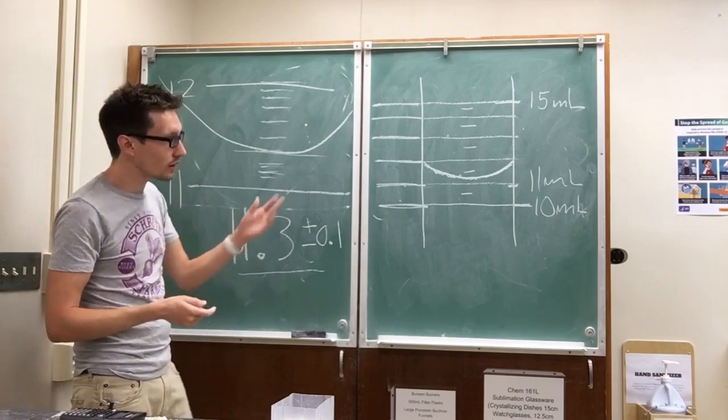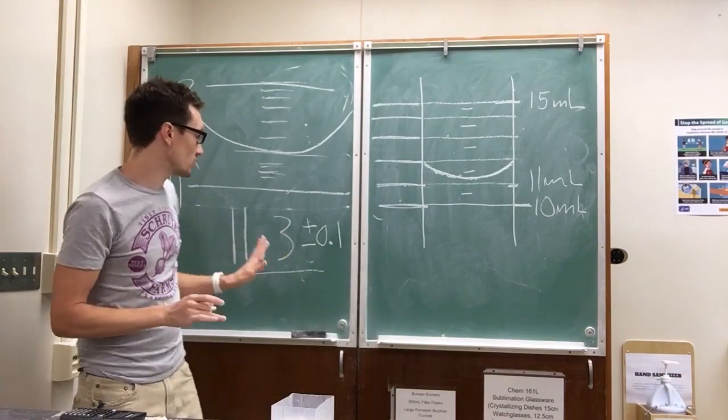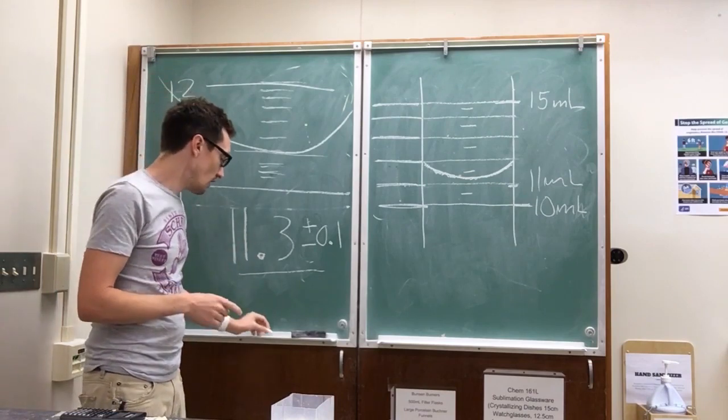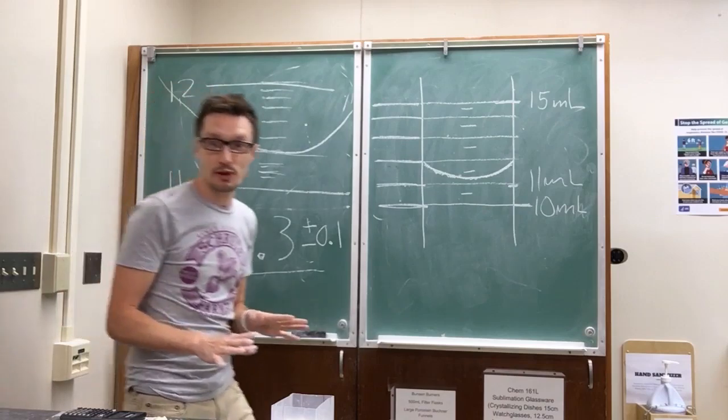A lot of students will look at this and say, oh, it's 11 milliliters. There's a little bit more to it. We need a little bit more precision and accuracy in our measurement when we're doing stuff in the lab. So, okay. Now we'll do the experiment, I promise.